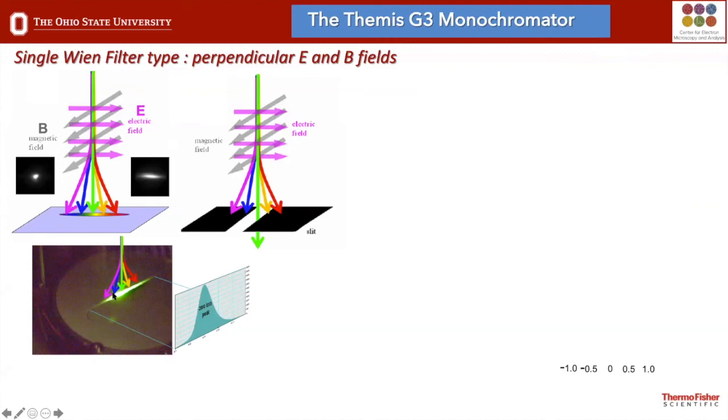We then have the ability to put a physical aperture or a slit in that'll cut off this energy spread, right? And this energy spread is one of the things that contributes to chromatic aberration in the microscope. So having electrons at different energies means that they're going to be focused to different points, right?